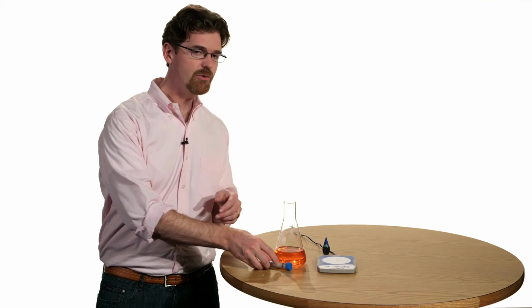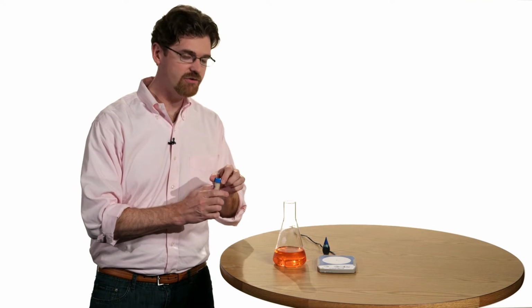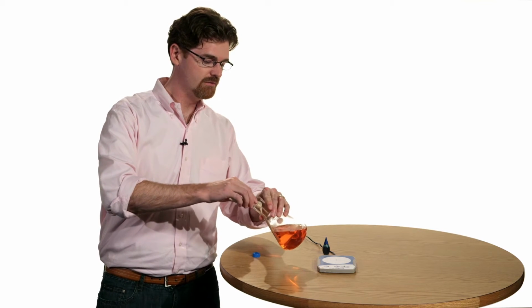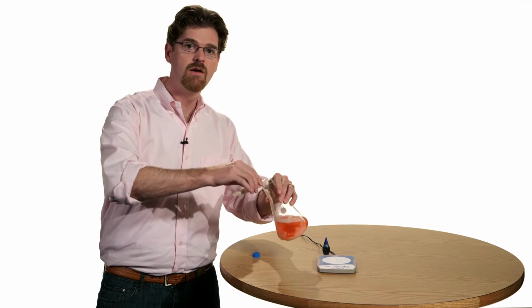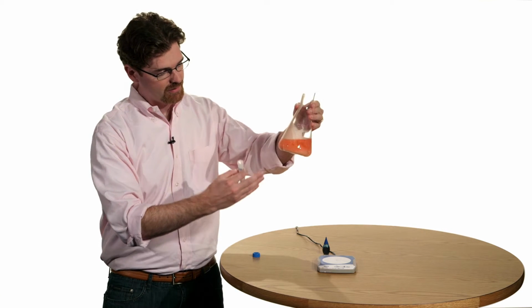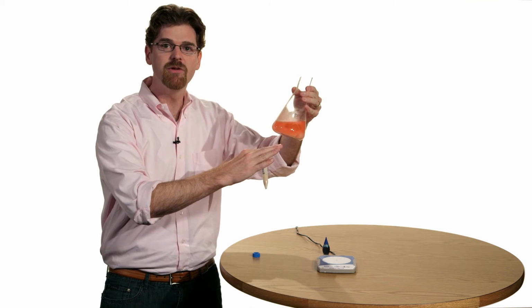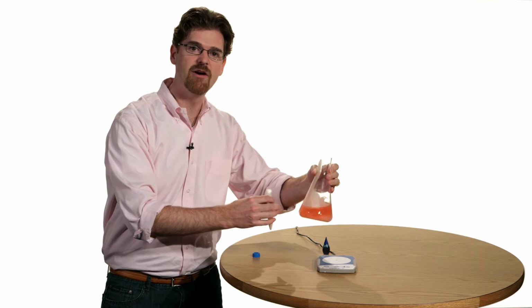Let's now take a look at how we start to construct both the design of a bioreactor and a plan for its operation. In the simplest cultivation, we could add cells like these yeast into a container with media. We can appreciate immediately that this is not a homogeneous mixture. The cells settle at the bottom of the container and are in a dense environment.